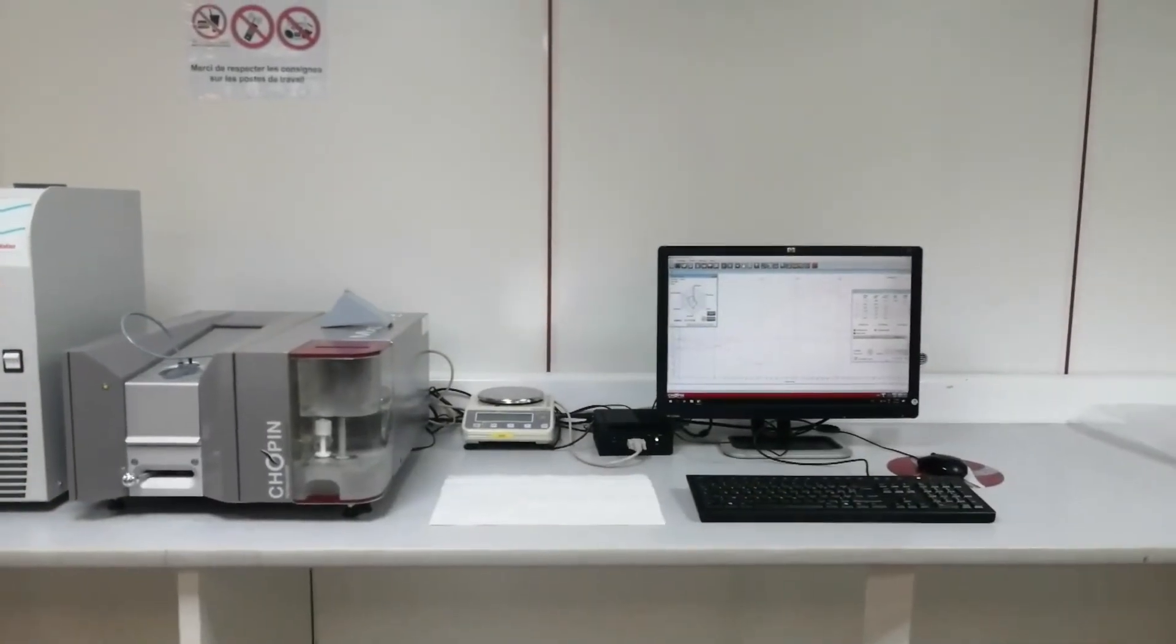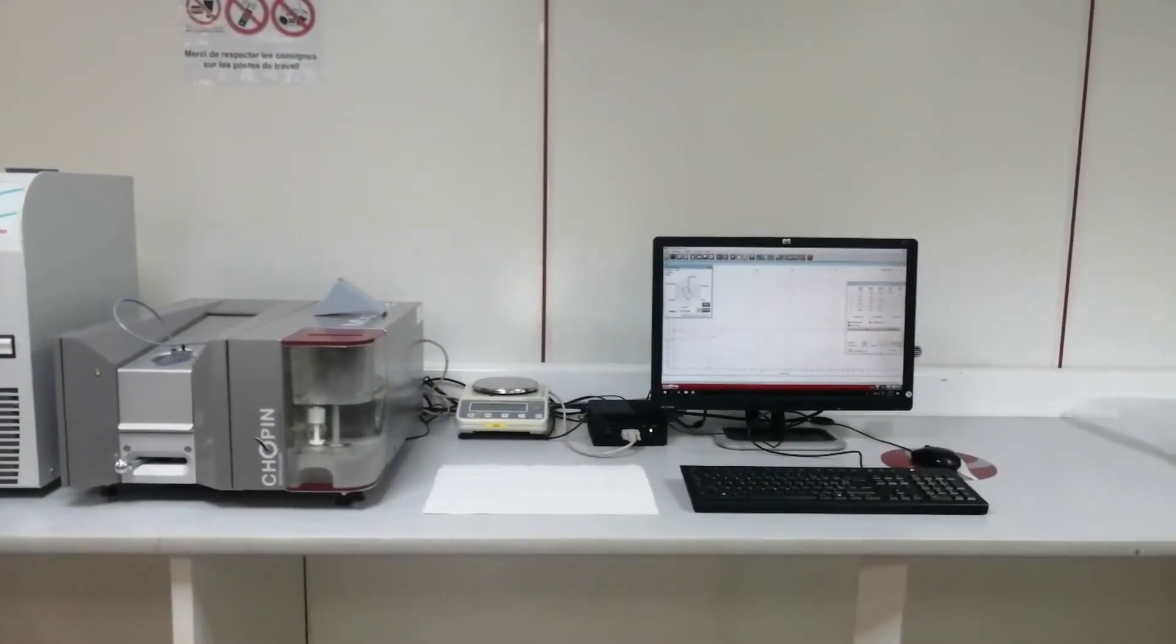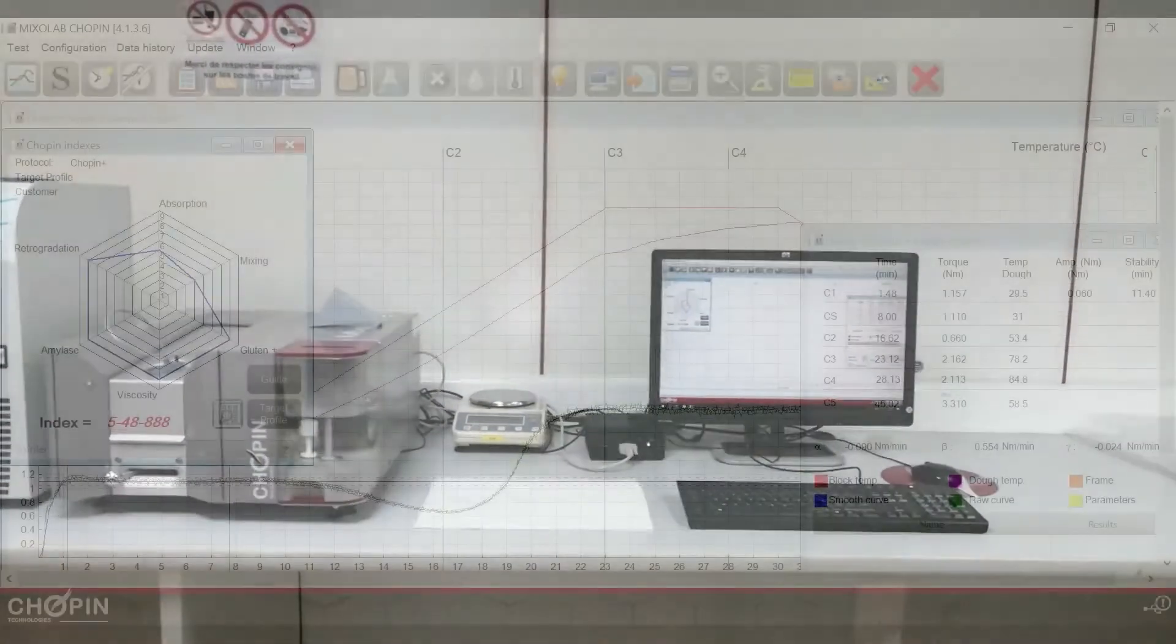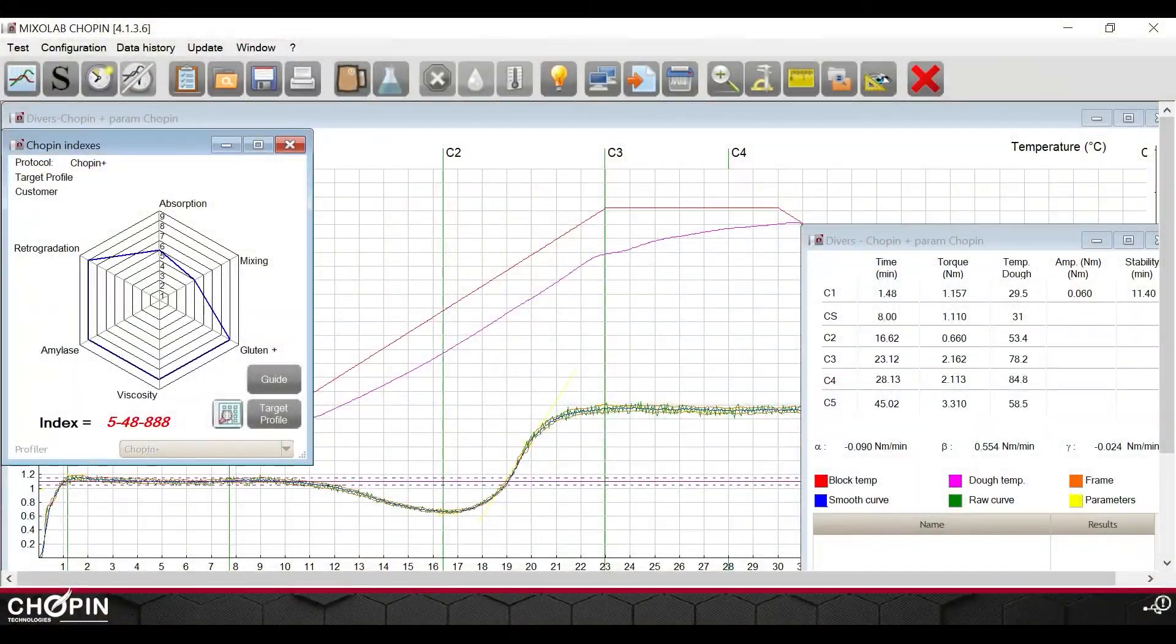After 45 minutes, in the case of the standard Chopin Plus protocol, the test will stop automatically and the test results are displayed.